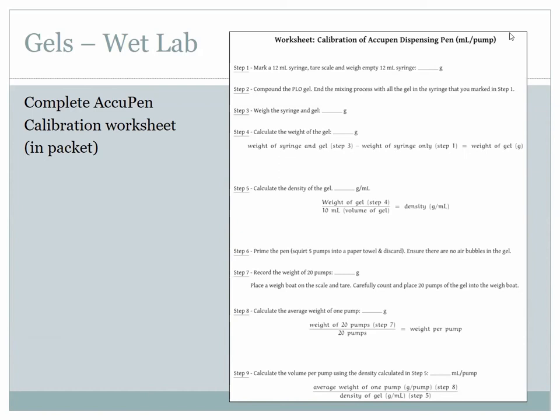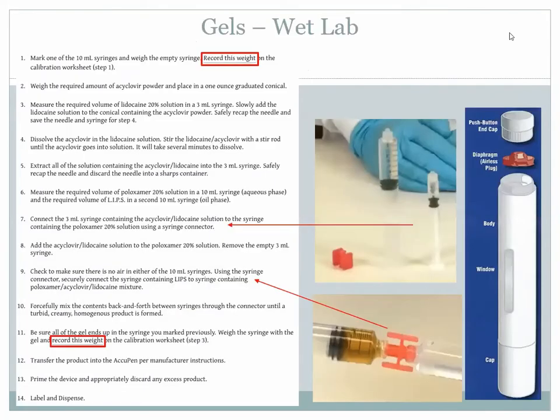So step 1 and step 2 are some very important things you have to fill out during the procedure. So I thought I'd point that out. Now, if you want to go back to the procedure, let me try to show you.